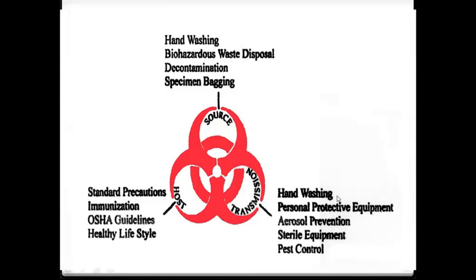Here is the biohazard sign — the three loops represent how we protect ourselves. For the source, we protect by hand washing, proper disposal of biohazardous waste, decontamination such as a 1-to-10 bleach solution, and specimen bagging — such as the biohazard bags we put specimens in after collecting.